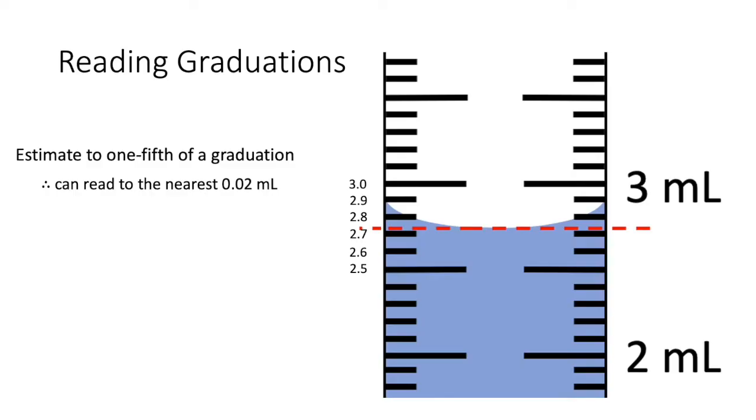The first decimal place we read from the graduations, and the second decimal place we estimate. Using this method, we can say that the meniscus is at 2.74 milliliters.